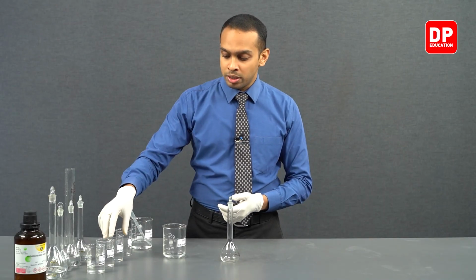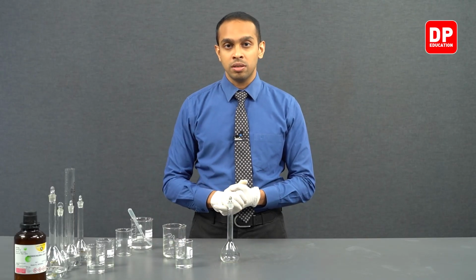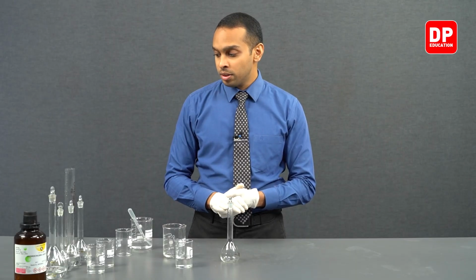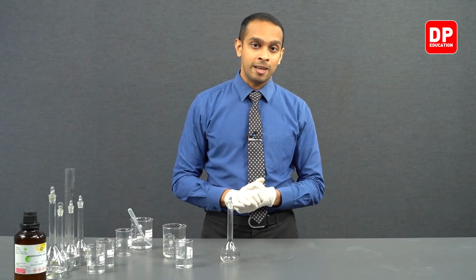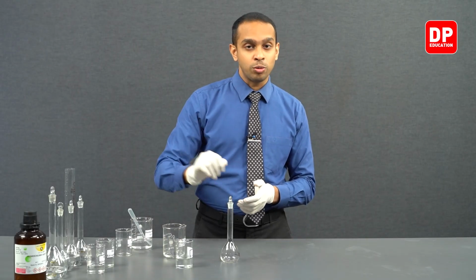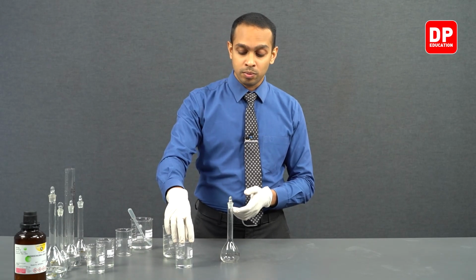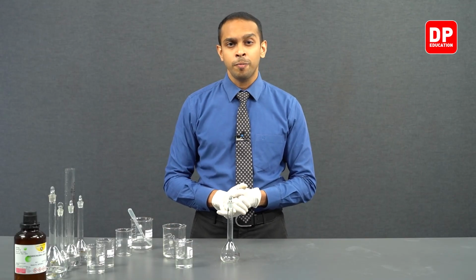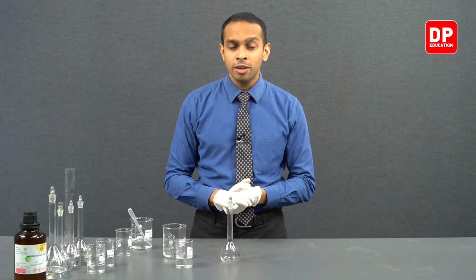We can actually take 0.4 moles per decimeter cubed concentrated HCl solution for this purpose as well, because 0.2 moles per decimeter cubed concentrated HCl has exactly half the concentration of this solution. So if you wish to dilute 0.4 moles per decimeter cubed concentrated HCl twice and obtain 0.2 moles per decimeter cubed HCl, you can do so.